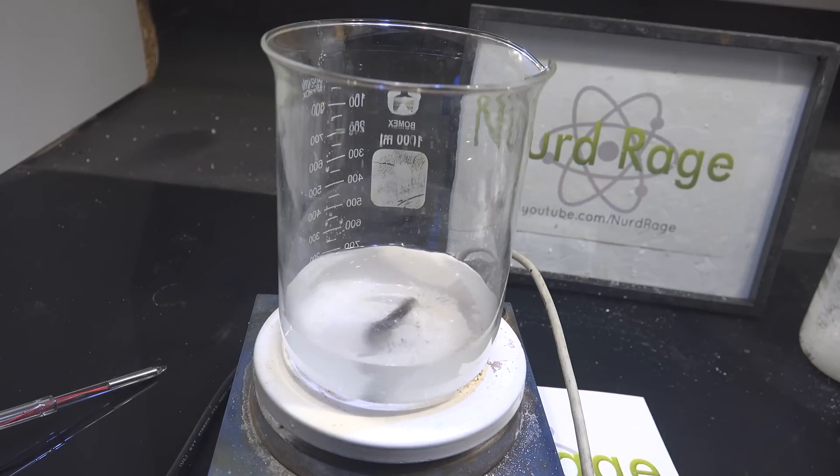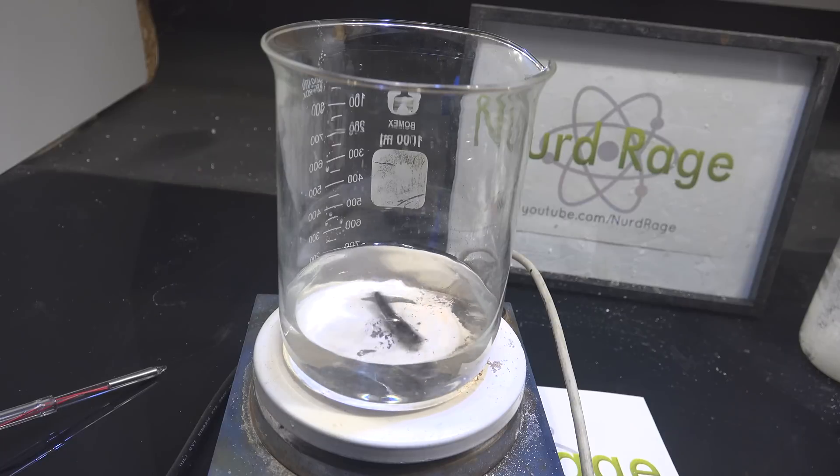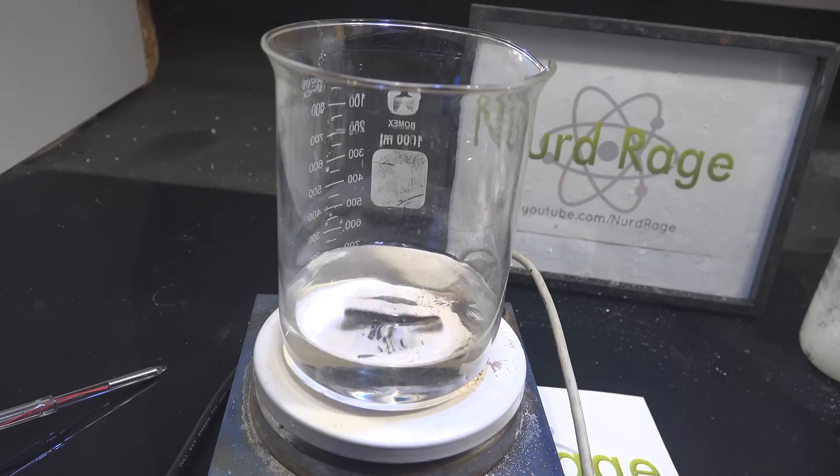We're going to add more water later, but using a lesser amount now helps to dissolve the luminol better, thanks to the high pH of the sodium hydroxide.